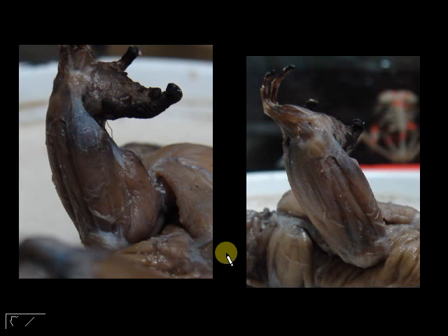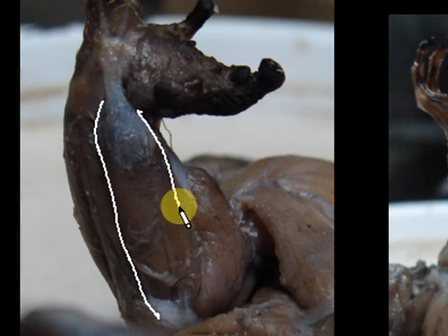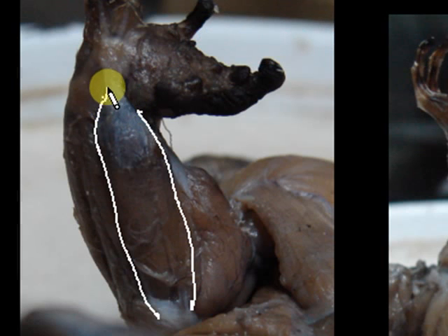This is the ventral view of the arm of your toad. One main muscle that is easily seen — that big fat muscle — is called the palmaris longus. Your clue is that there is a connective tissue that connects it to the palm, hence it's called palmaris longus. Longus because it's long. So you just look for the biggest muscle in the ventral view and that is your palmaris longus.